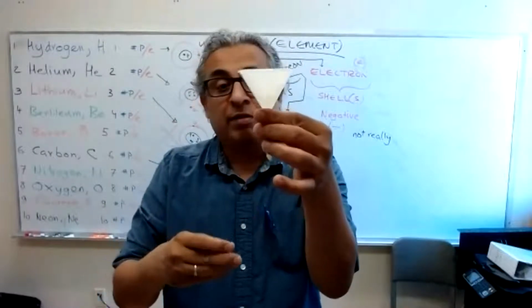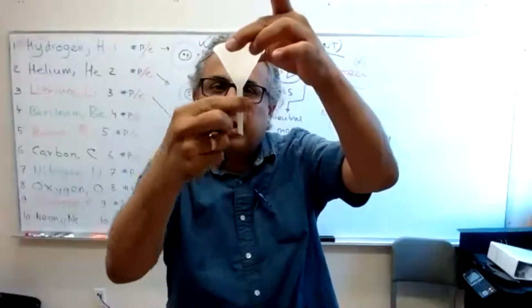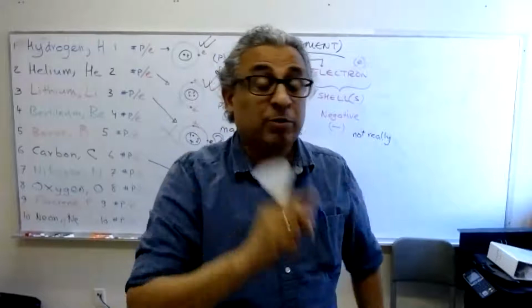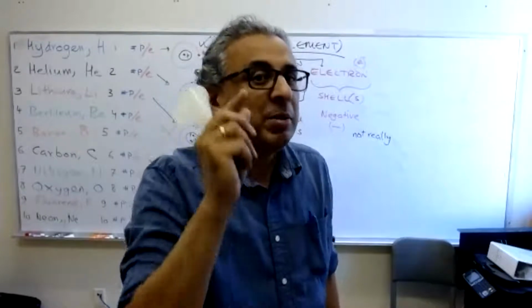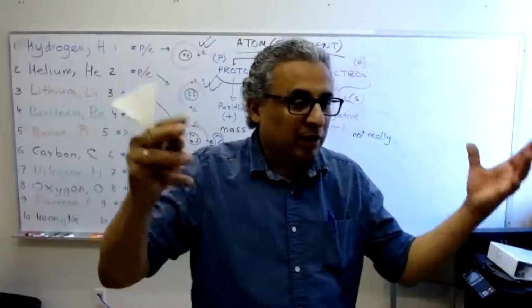Some filter funnels do not have the stem. It's cut from here. There is a reason for that. You can think about it. That could be a bonus question. My quizzes usually have some bonus questions, but they will always require you to know a little more and think a little beyond the level that we are all dealing with.